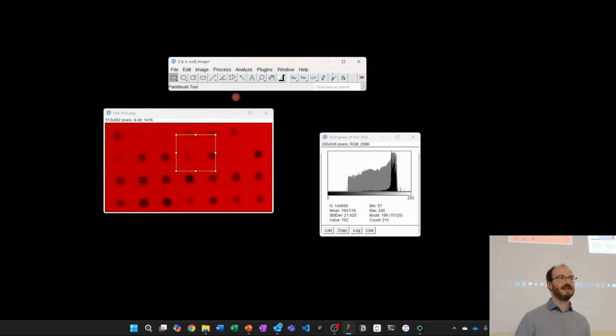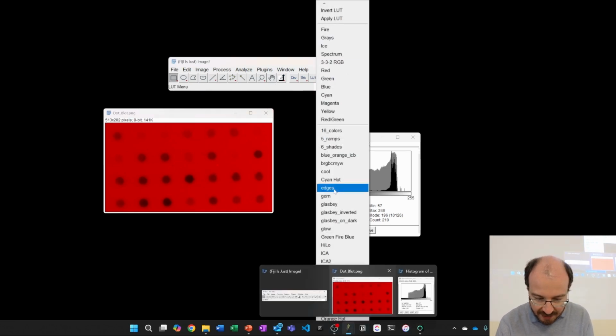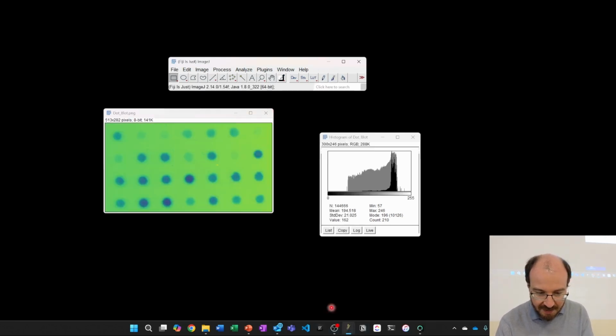If you see a green channel and a red channel overlapping for colocalization, it's going to look yellowish. It's like, okay, the yellow is telling me this colocalization. So the colors are helpful, but they're just a visualization tool. They're not actually supposed to be used in analysis. And there are some shortcomings to that, which we'll also get into. Okay, what I was getting at is my next point. I'm just going to apply maybe Viridis. That would be a good one to work off as a base here.